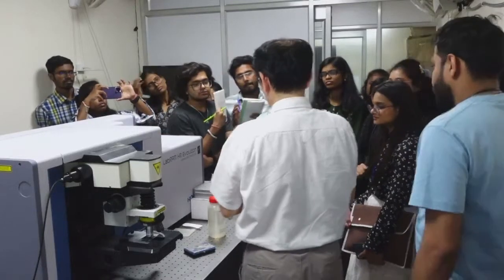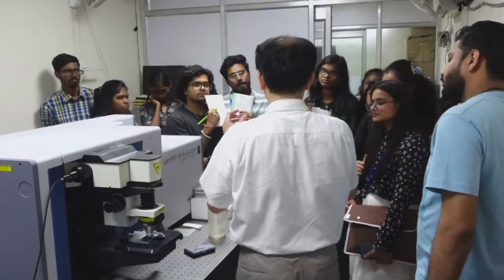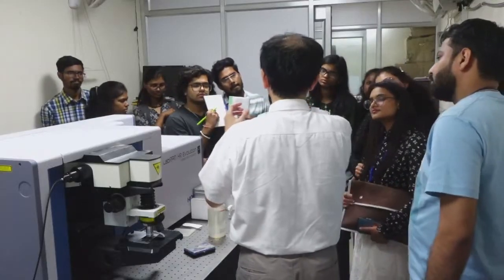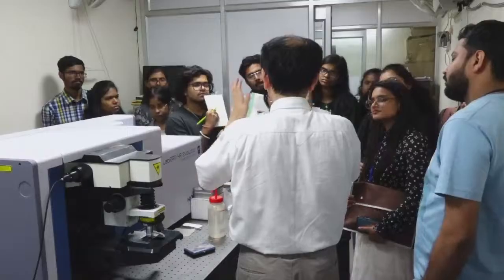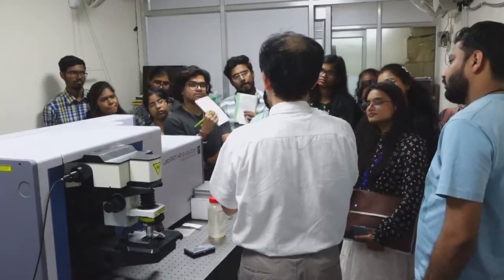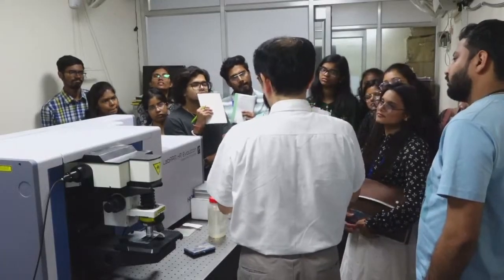Okay. I derived some formulation about Raman intensity. Raman intensity, I Raman, is in proportion to I0. If we introduce a stronger excitation beam, then the Raman scattering should be stronger.